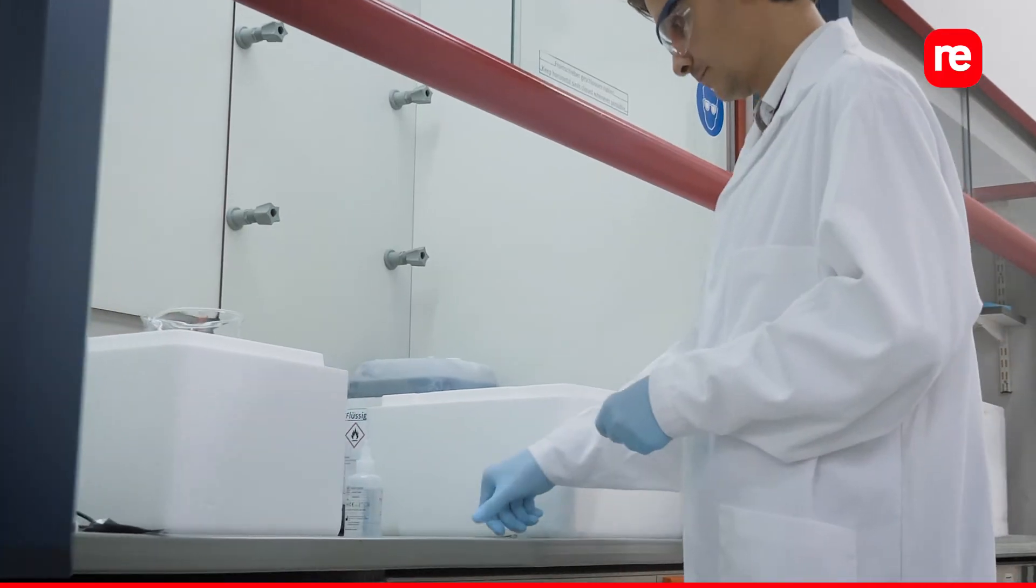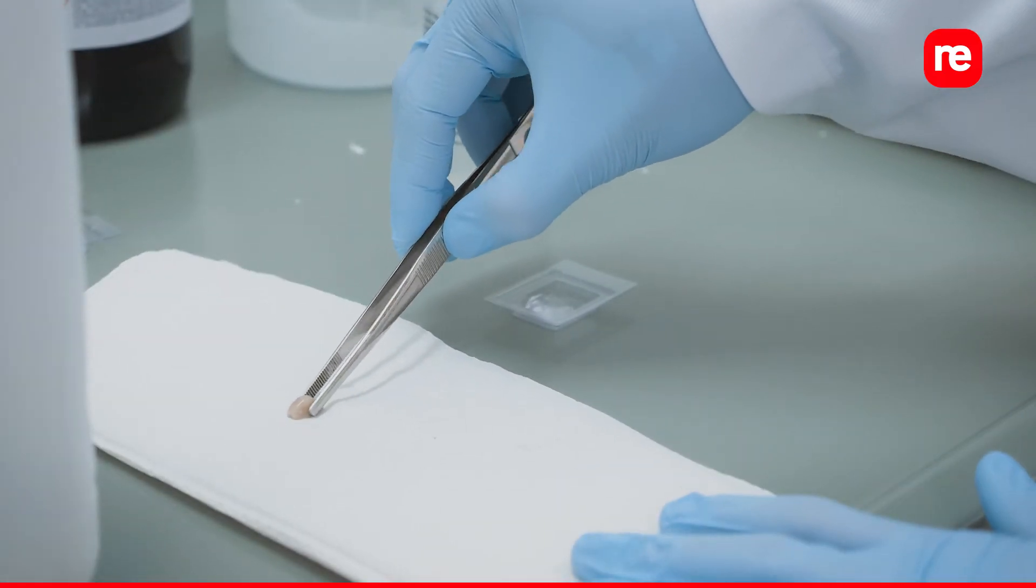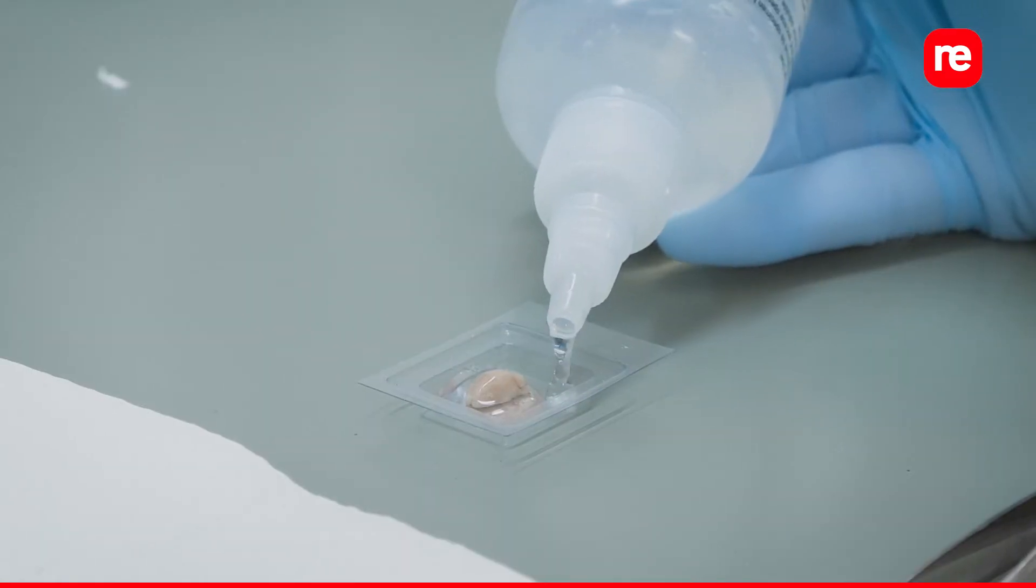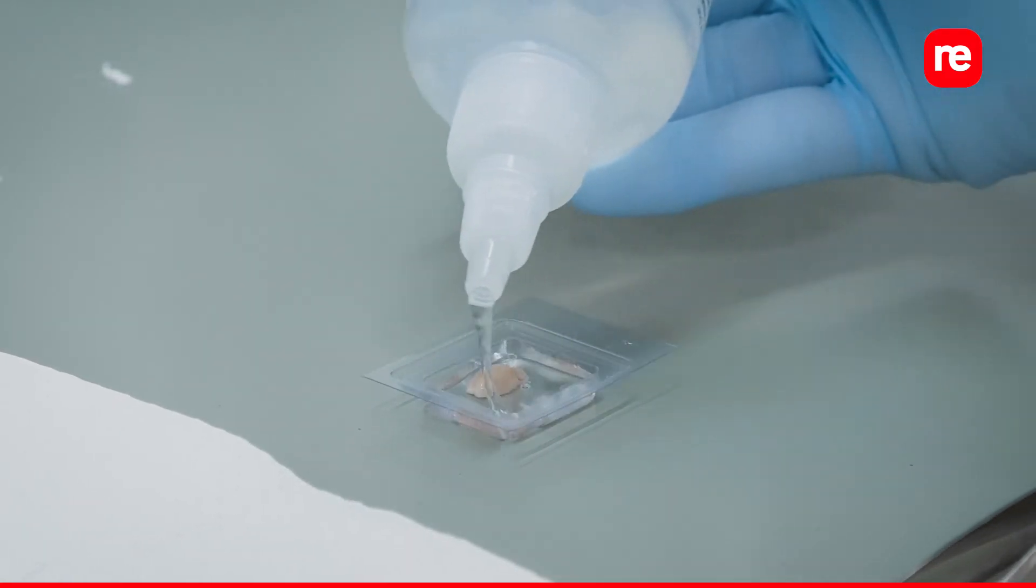For small samples, we advise to use cryomolds and OCT to freeze the sample. Place a drop of OCT at the bottom of the cryomold. Place the tissue with your region of interest to section at the bottom and fill the rest of the cryomold with OCT.